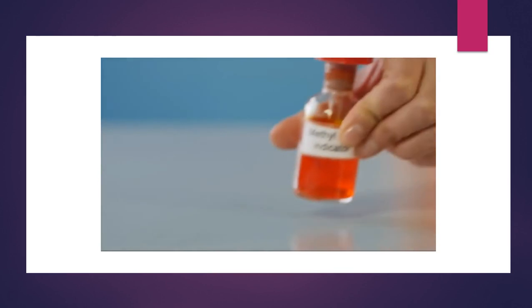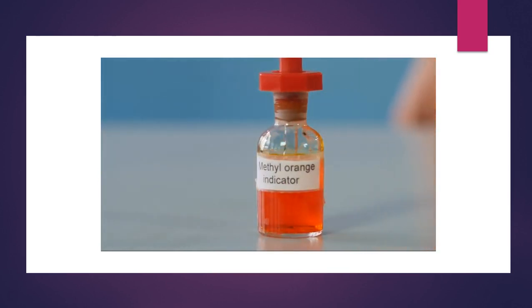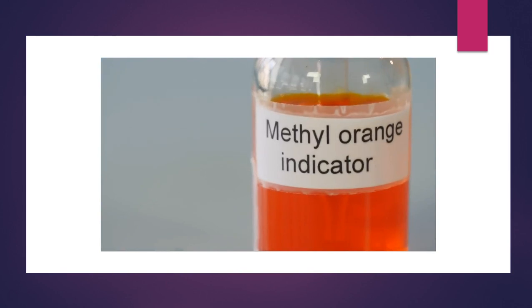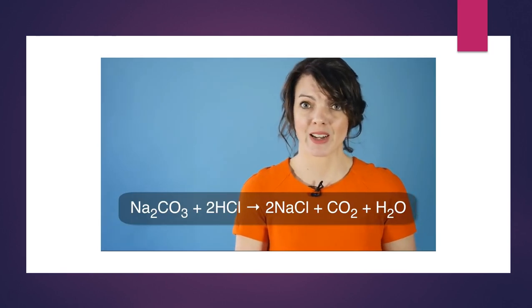In this acid-base titration a standard solution of sodium carbonate will be used to determine the exact concentration of a dilute solution of hydrochloric acid. An indicator solution will be used to help find the end point of the titration. In this case methyl orange will be used, which will turn from red to yellow. Here is the equation for our reaction.